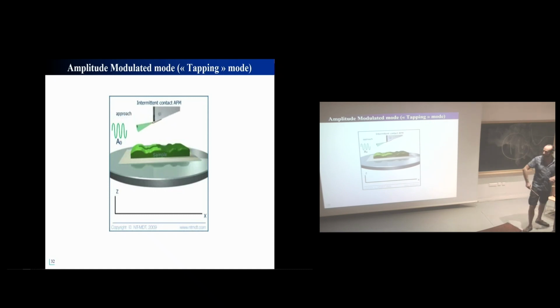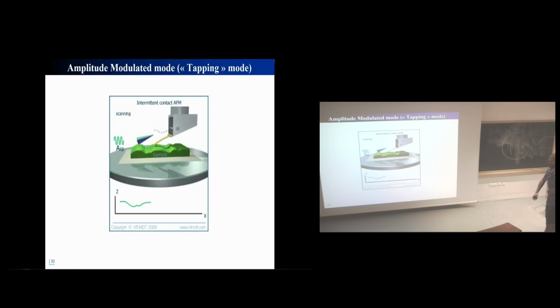Far away, you have the free amplitude, while once engaged, the amplitude set point is smaller, of course, because you want to interact with the surface. And this is always the same story.